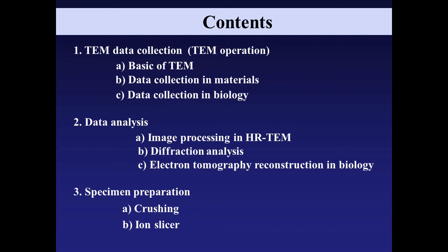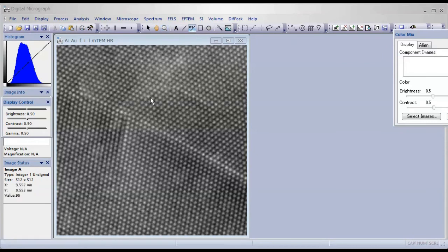Okay, and the second question is, I would like to know about lattice spacing measurement in TEM. And also one more question: you want to make a measurement of d-spacing from electron imaging, and also compare with XRD. I will just introduce an example of analysis. Let me see. Okay, let me see. This data was measured with the Gatan Digital Micrograph. Like this, you can see the spacing measurement. This is just an example of the measurement function, or intensity profile, like this.